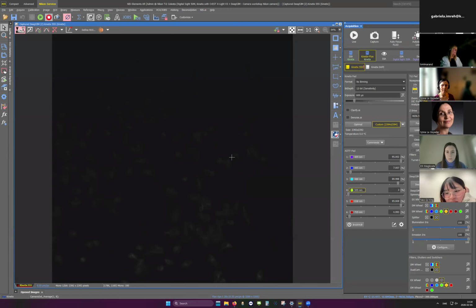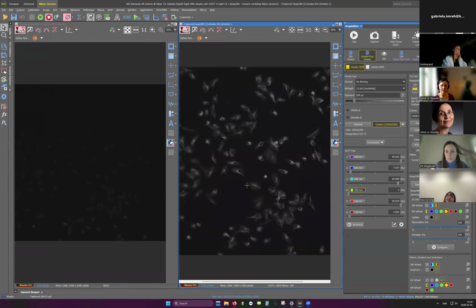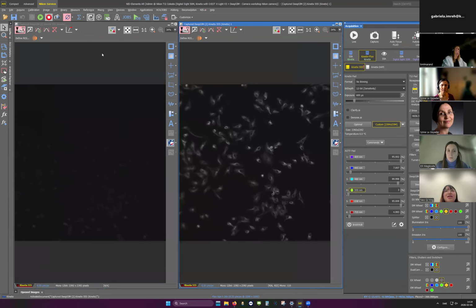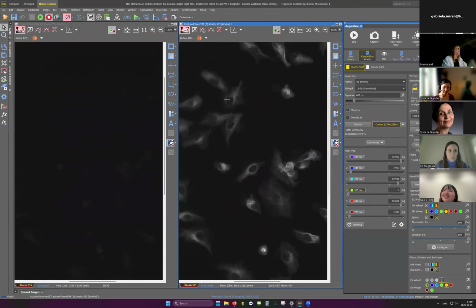Noise in the image is random. The signal is on the same pixel all the time. So it will basically smooth out those random appearing pixels in these 8 images. And I think you see already here, I'm going to synchronize it, that in this we are increasing the signal, but we are reducing the noise.